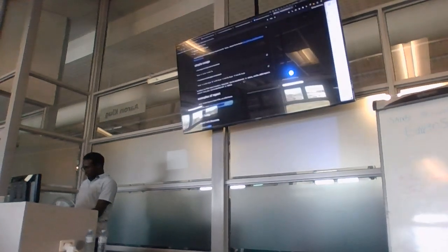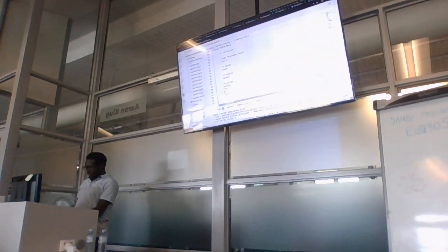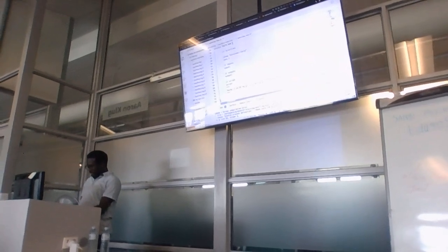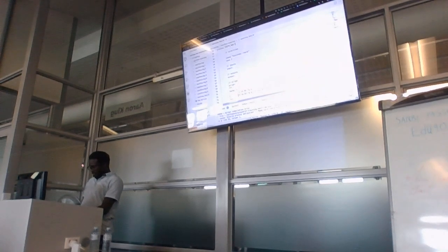So I already know this is how it's gonna run. For the new line in Nextflow, you use this type of backslashes. I have an idea, that's how it's gonna run.